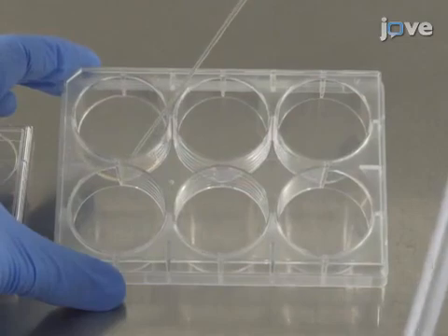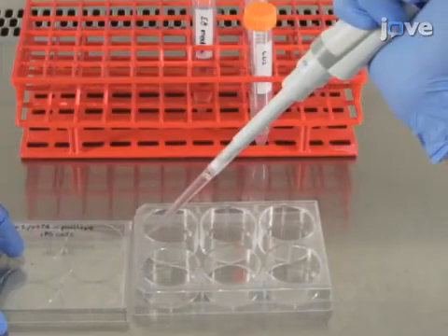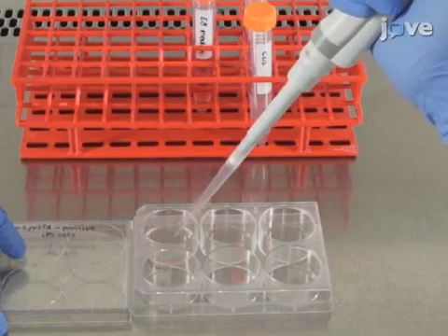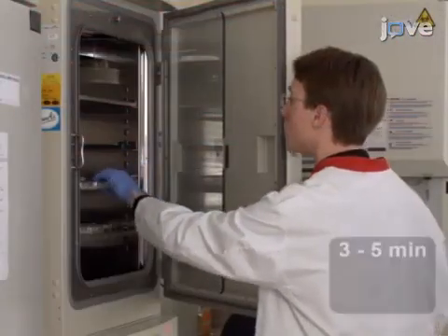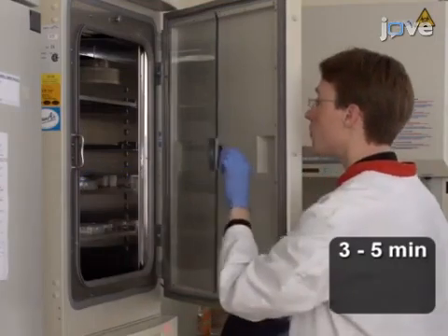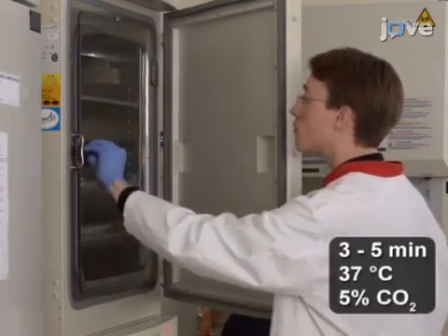Aspirate the spent medium of the RTTA NGN2-positive hiPSCs and add 1 milliliter of CDS to the cells. Subsequently, incubate the cells for 3 to 5 minutes in a humidified 37 degrees Celsius incubator.